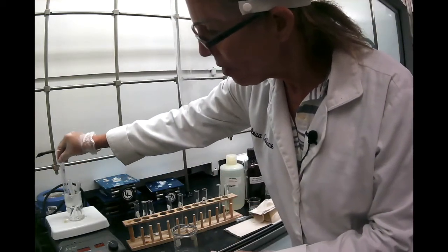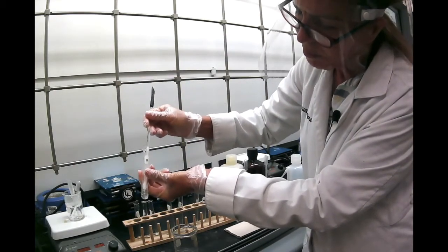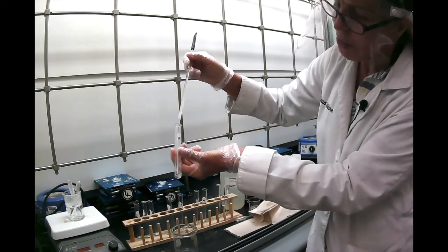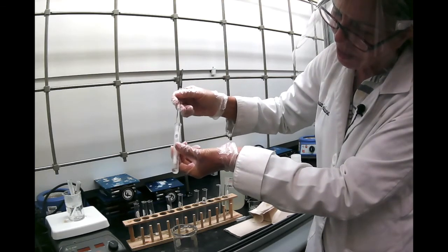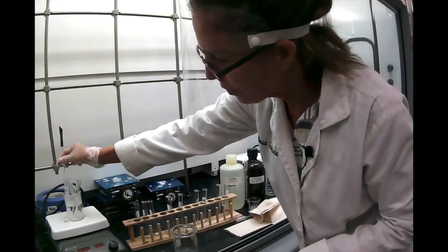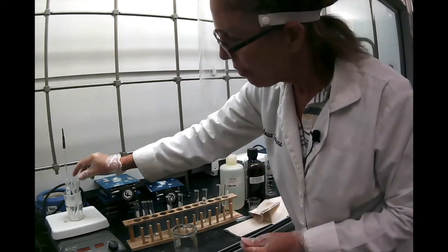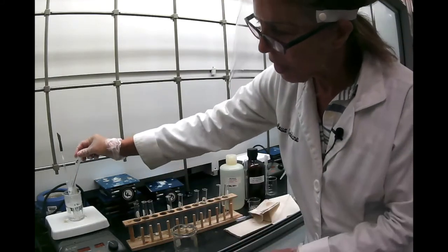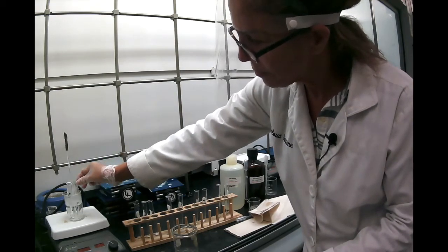So this was my naphthalene, and you see it condenses on the stirring rod. It kind of dissolved, but it also condensed on my stirring rod, so I have to put it back in hot water. It is kind of soluble, but not very soluble. This is benzoic acid, and it's not dissolving much, but we'll wait. And this is the acetanilide.